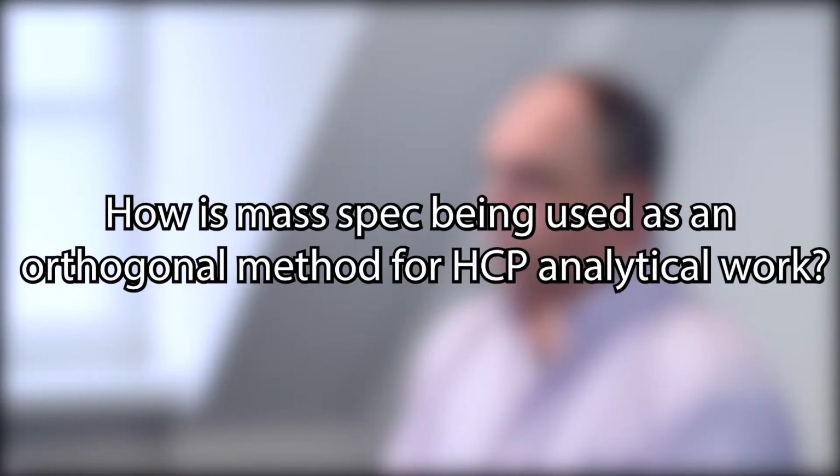How is mass spec being used as an orthogonal method for HCP analytical work? Recently, an orthogonal method has been added in addition to 2D Western blot as a way to validate anti-host cell protein antibodies. And mass spec has some advantages in that it does not require immunogenicity of the protein species in order to detect it. So in that sense, it's unbiased at the different anti-host cell protein species.